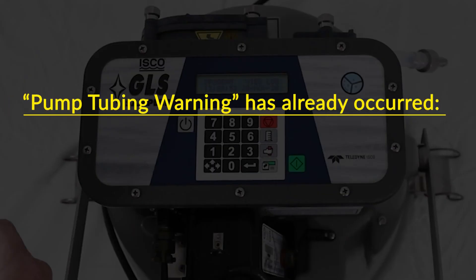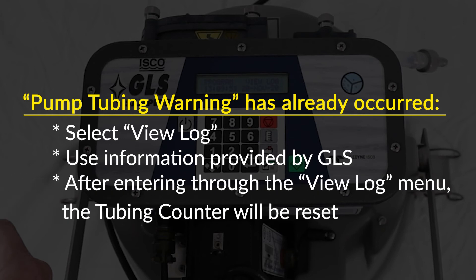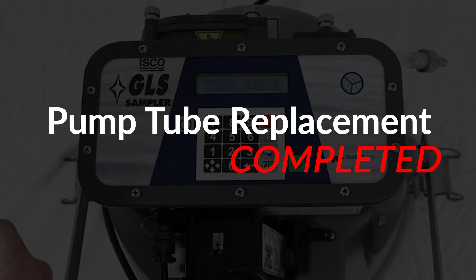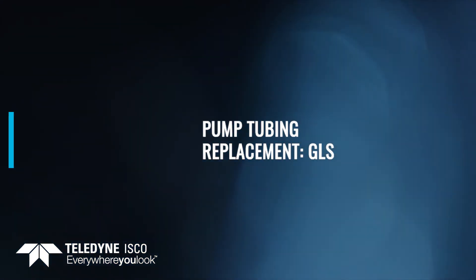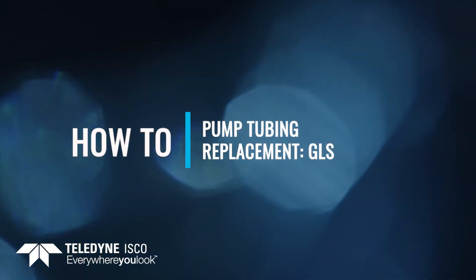If the pump tubing warning has already occurred prior to tubing change, you can select View Log and enter through the information provided by the GLS. After entering through the View Log menu, the tubing counter will be reset. Pump tube replacement is now complete.